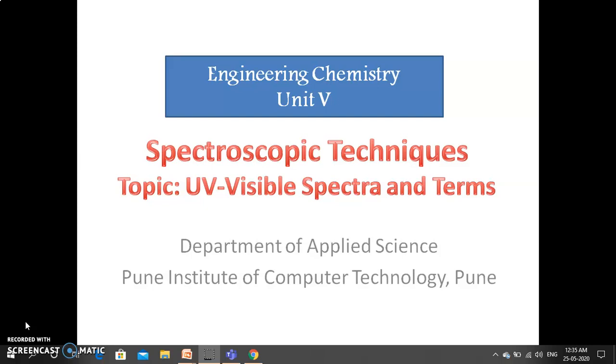The instrument which is used to analyze the sample based on its interaction with the UV visible radiation is called a UV visible spectrophotometer. This UV visible spectrophotometer works on the principle of Beer's law and theory of electronic transition.